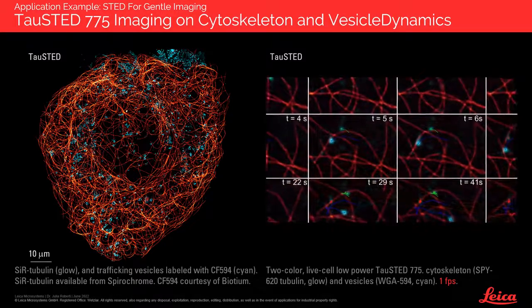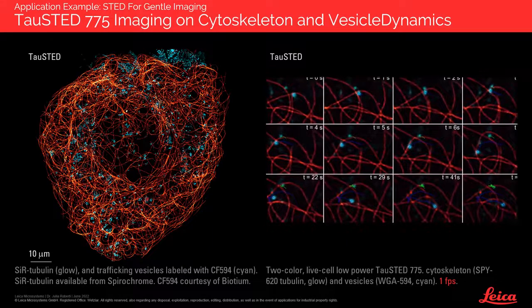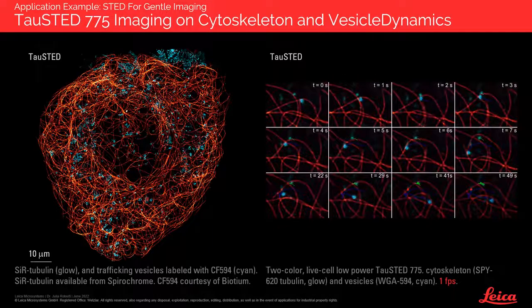And we have done that, and you can see here in this gallery how we can track the movement and pinpoint the position of the super-resolved vesicles over time.